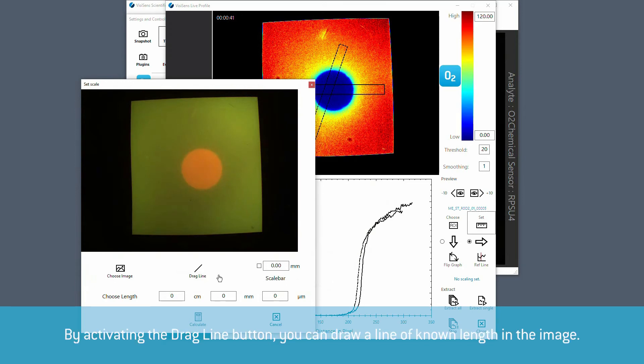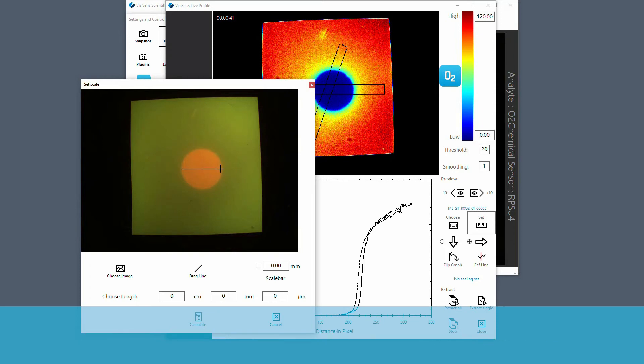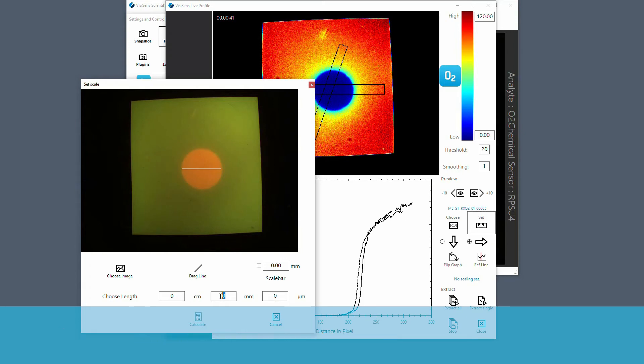By activating the drag line button you can draw a line of known length directly in the image. The length of the line can be defined in centimeter, millimeter or micrometer. Furthermore you can define a scale bar.